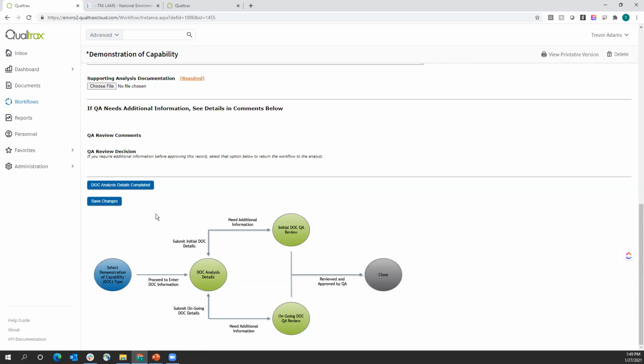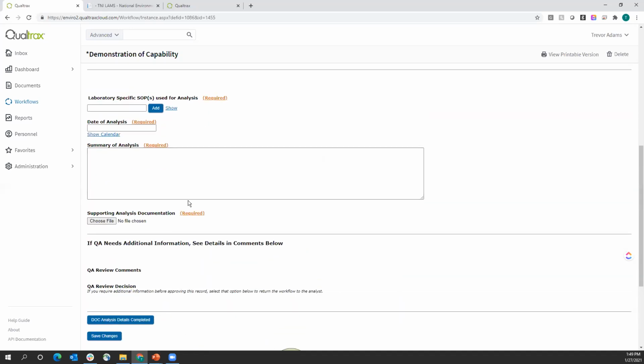You can put in as much information about the workflow as you want into that email. So if you reject it, you could have the email go back, have the rejection details directly in the email so they see it and then can log in and complete that. And all of that is just tied around clicking the button and it'll auto-generate that for you. Yep, great question.